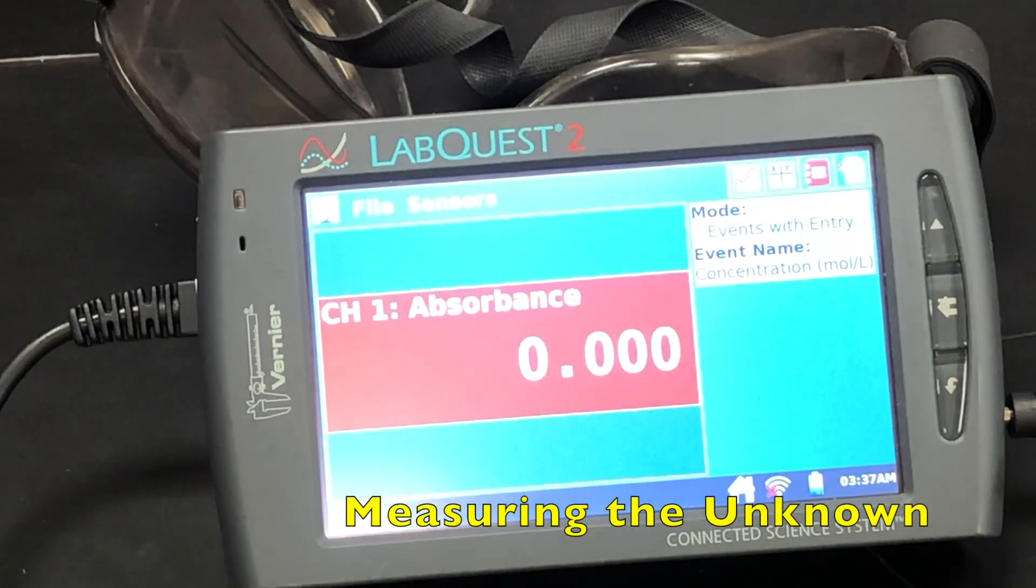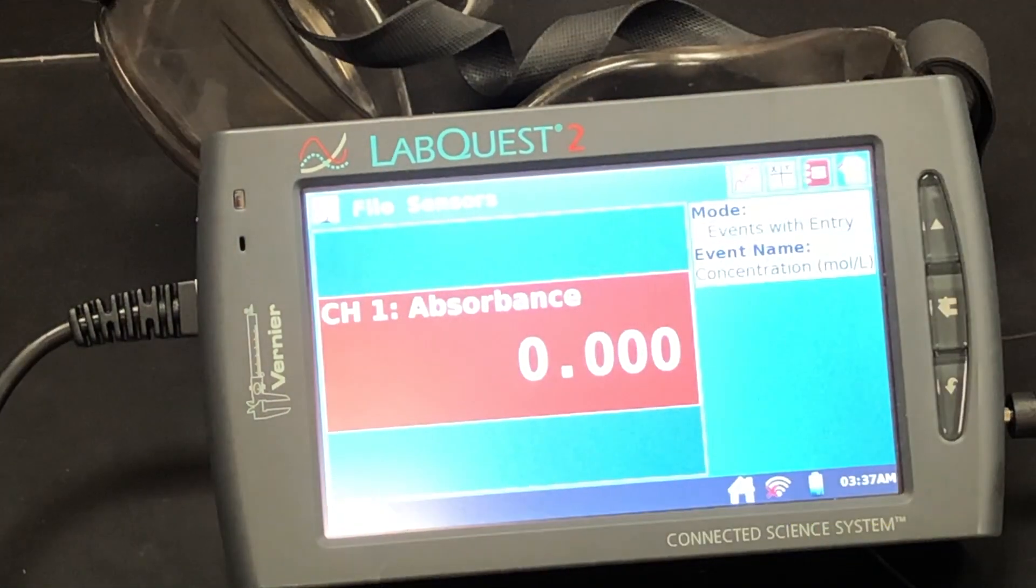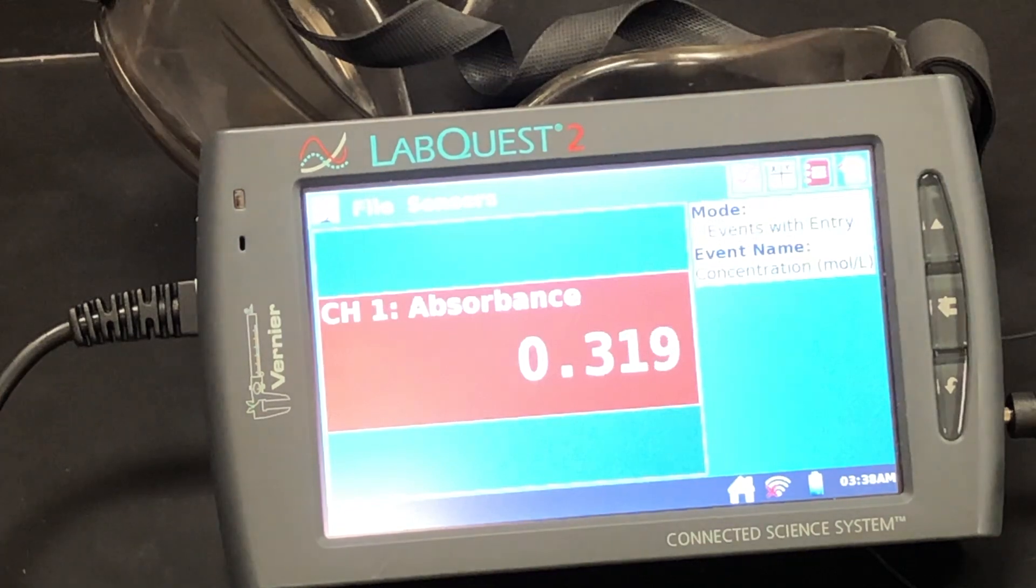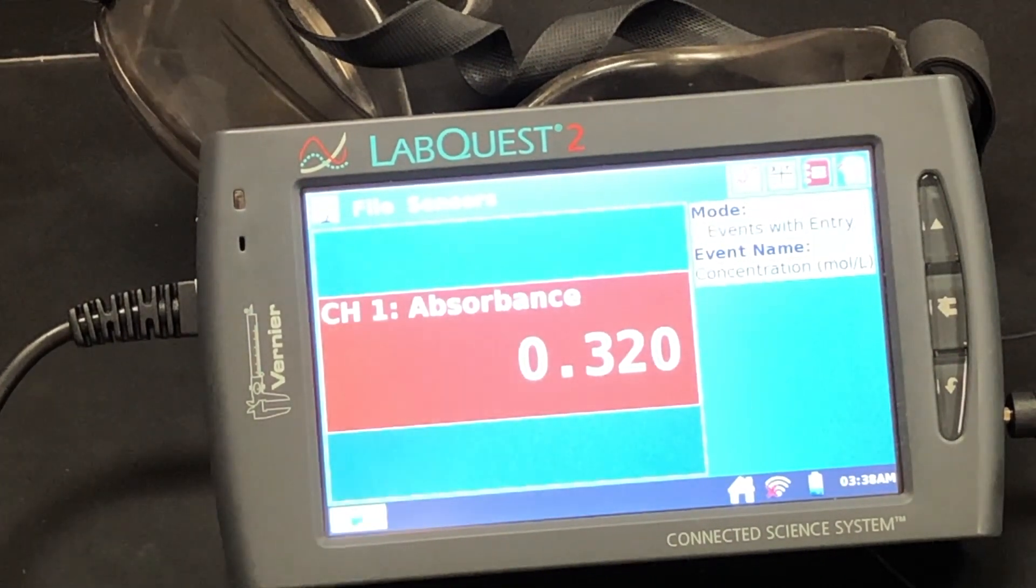And now it's time to measure the concentration of the unknown solution. We're going to put it in the colorimeter and measure the absorbance. Once the reading stabilizes, you take the absorbance reading, and then whatever the value is for that, that will be substituted into the line of best fit equation. So it looks like our reading is 0.320, and now we're going to use that to calculate the concentration of the unknown solution.